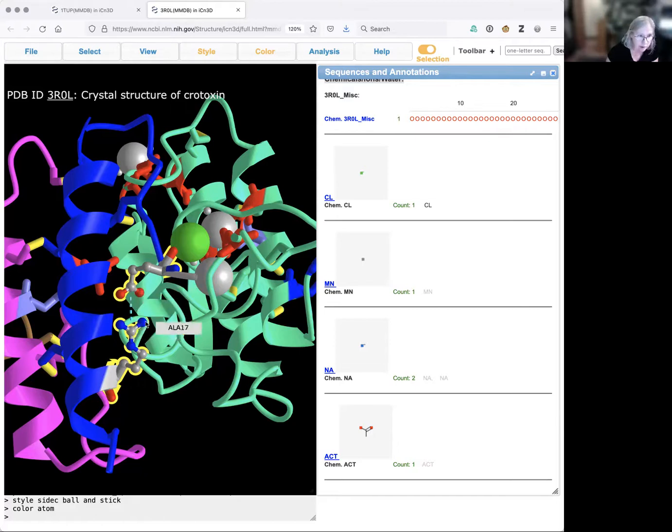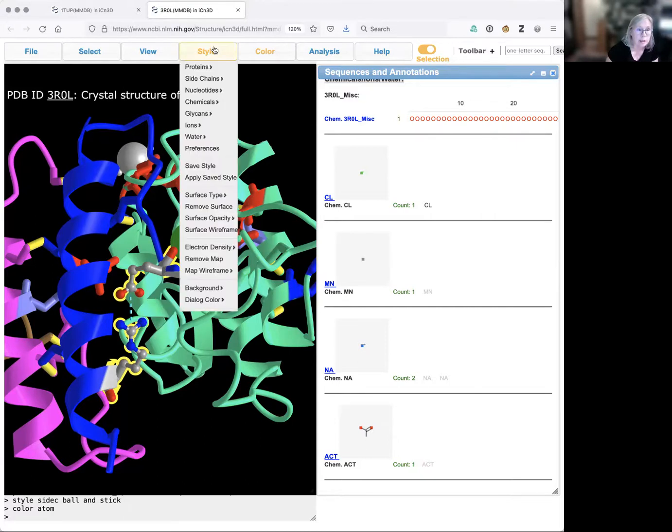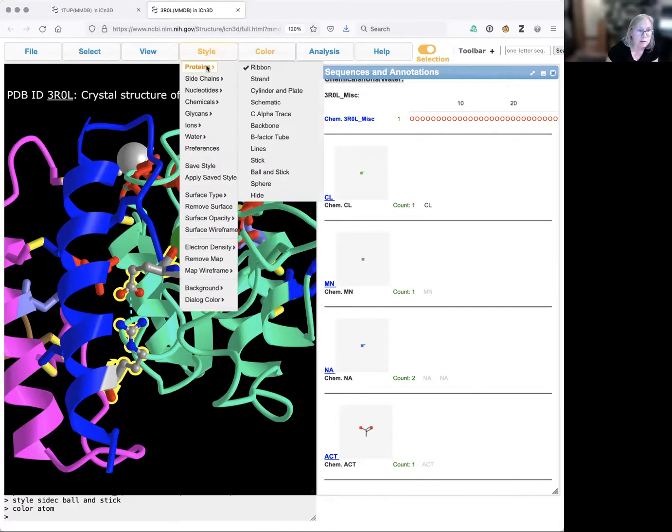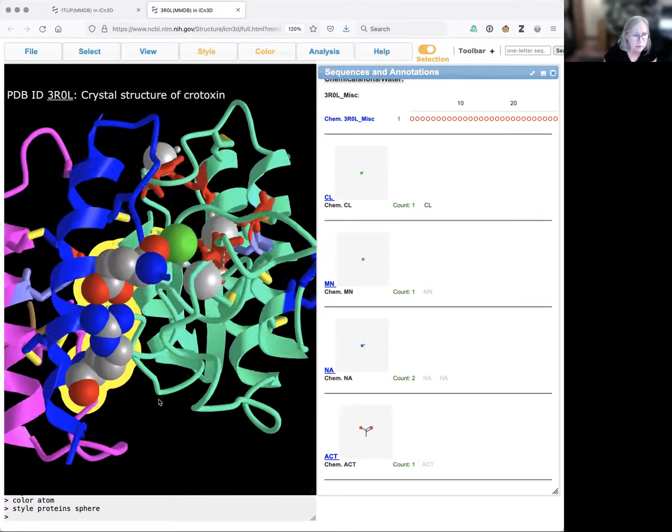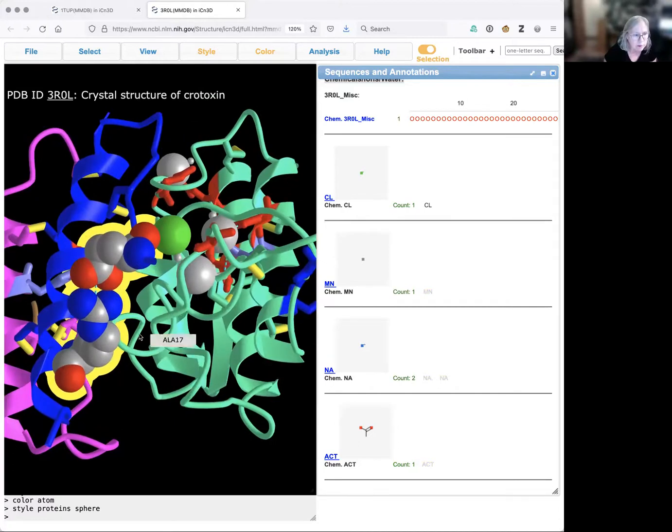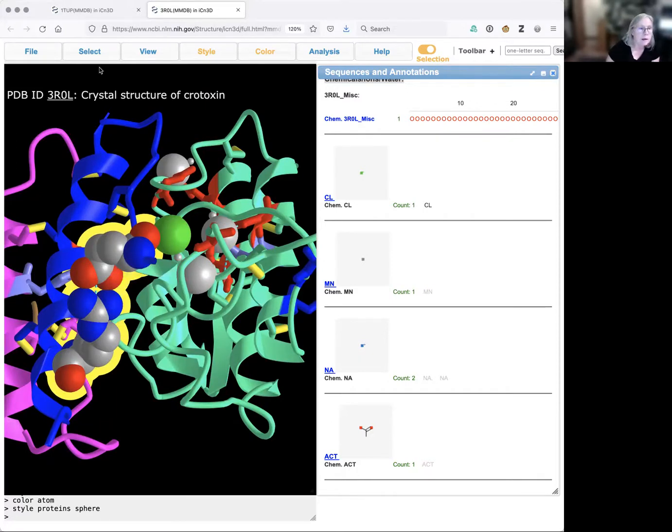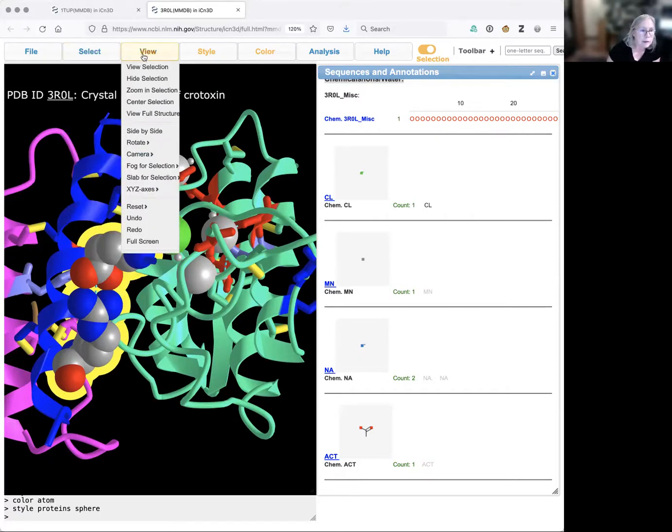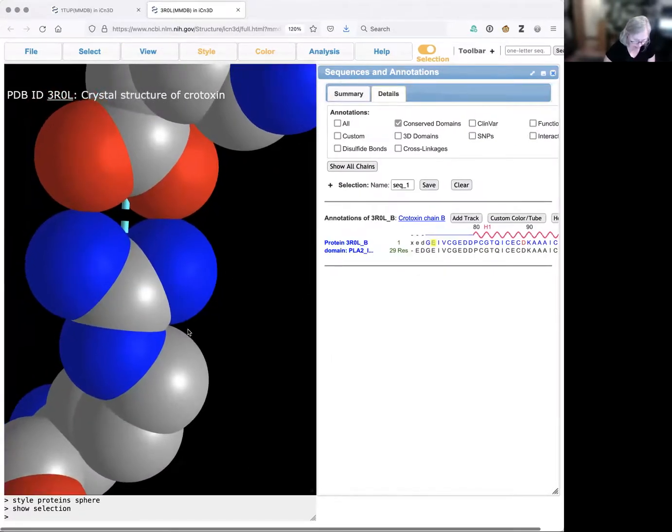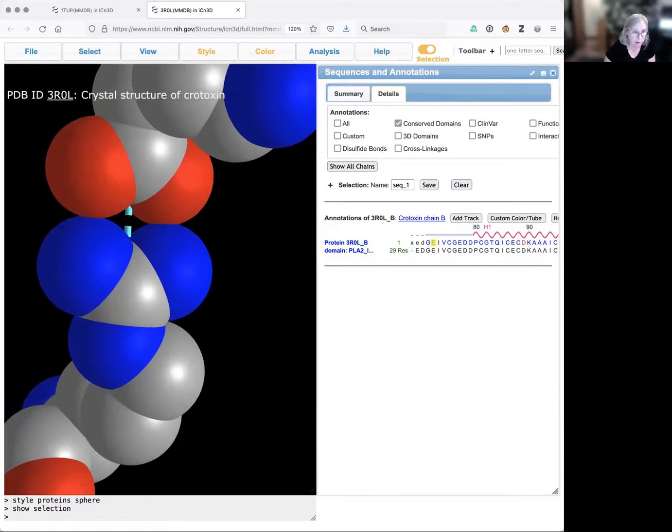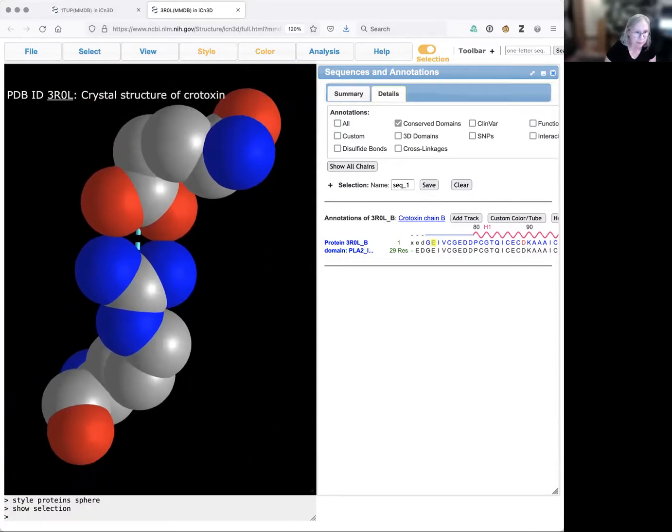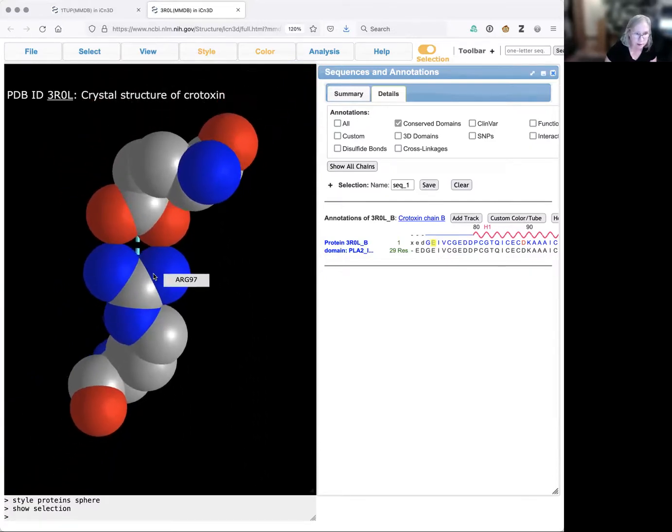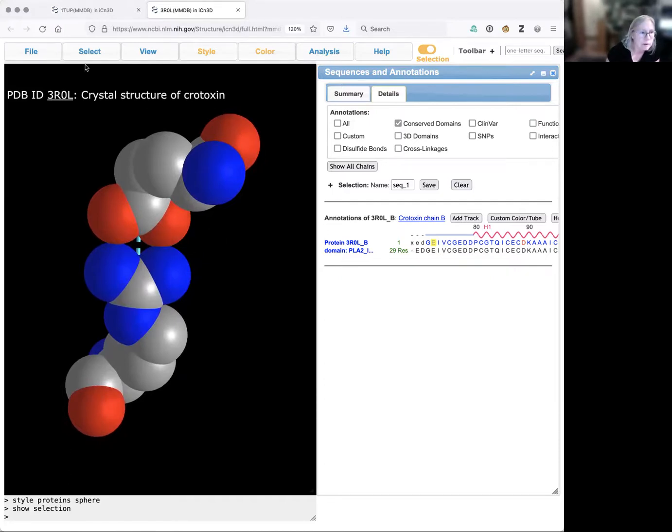Now I'm going to change the drawing style to show these as a sphere so you can see even better how they're interacting. I've got my positively charged arginine interacting with my negatively charged glutamic acid. I can look at these alone by saying view selection, then I can zoom out and capture a screen image.